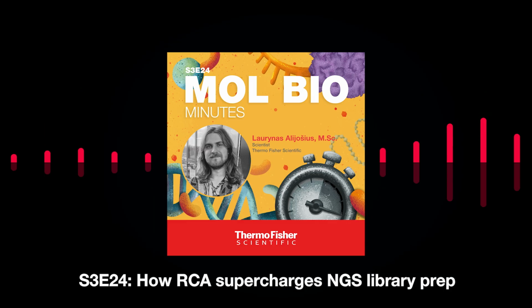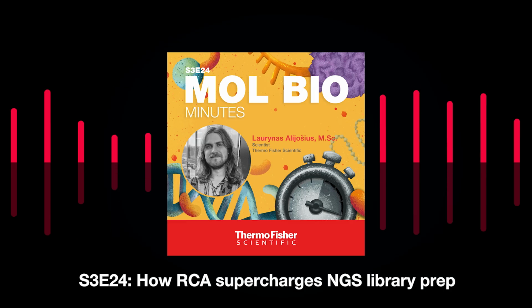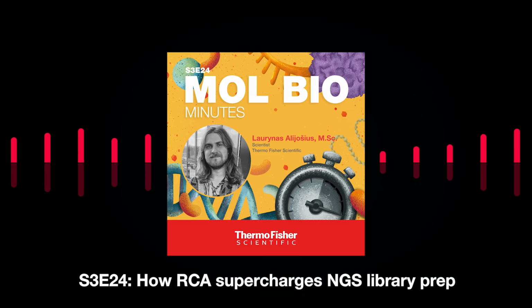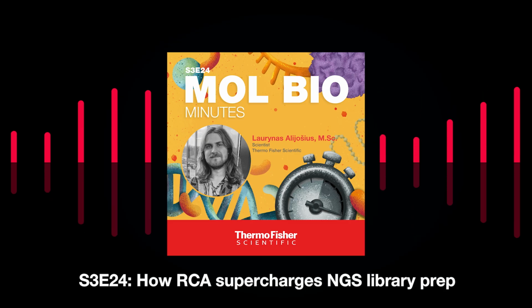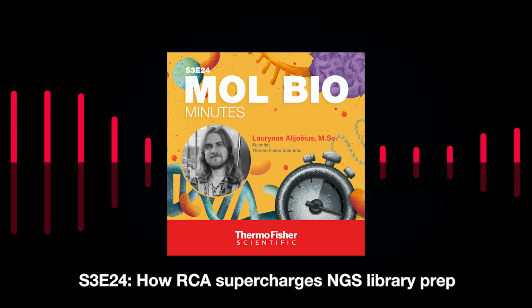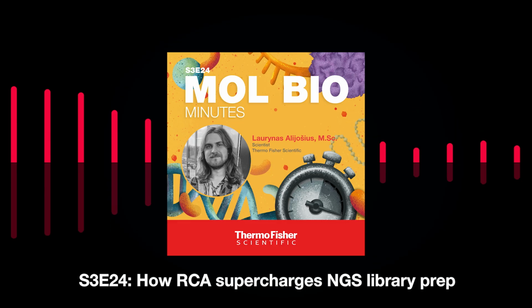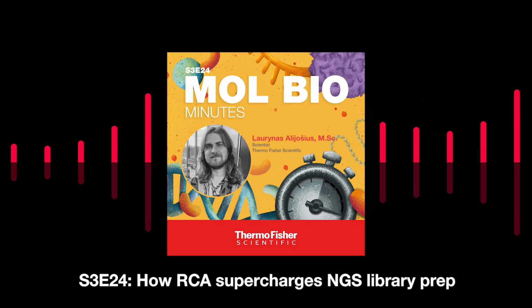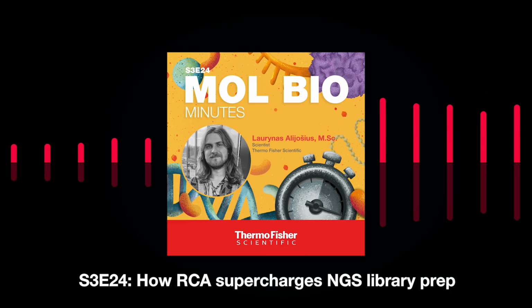RCA can also help when NGS is used to detect single molecule mutations. In this case, RCA-based target enrichment can be used before library preparation to improve NGS-based rare variant detection. If we talk about whole genome amplification, which uses the same polymerase as RCA, it can be used similarly for single-cell genomics or even for transcriptome profiling of low-abundance RNA molecules such as circular RNA.